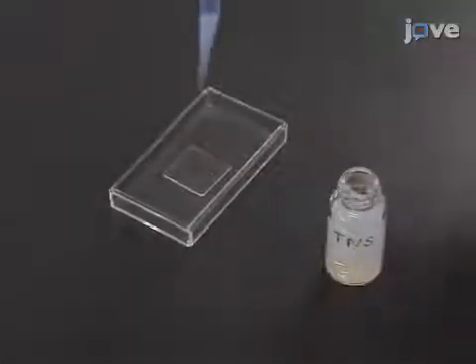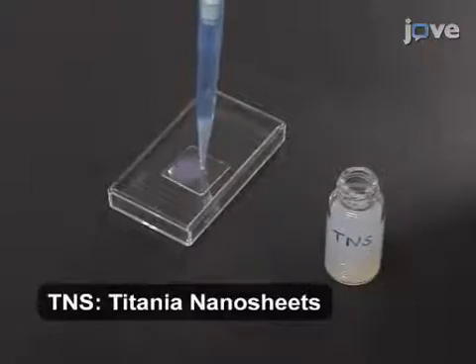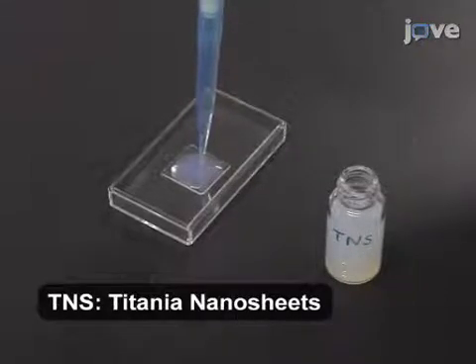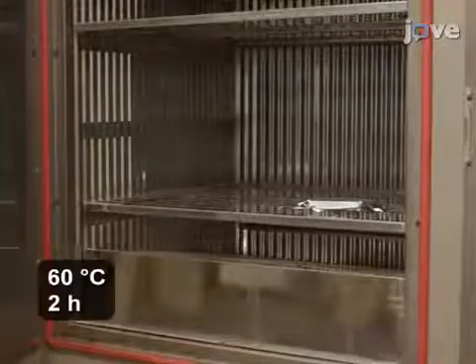Now cast a previously prepared colloidal suspension of TNS on the glass substrate in 300 microliter aliquots. Dry the glass substrate at 60 degrees Celsius for 2 hours in a dry oven to give the TNS cast film.